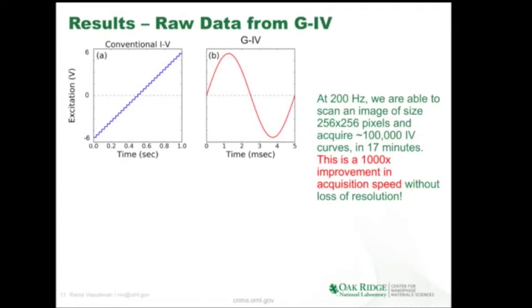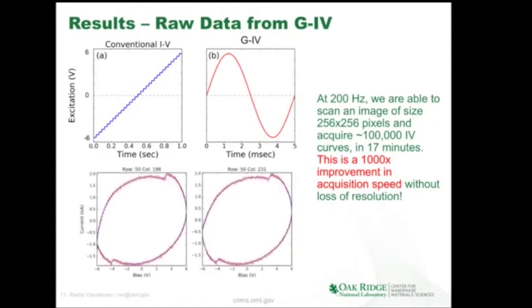I should note also that this is without any loss of spectral resolution or spatial resolution. In fact, it's an increase in spatial resolution. It's not even a loss. So if we look at the raw data, this is what it looks like.